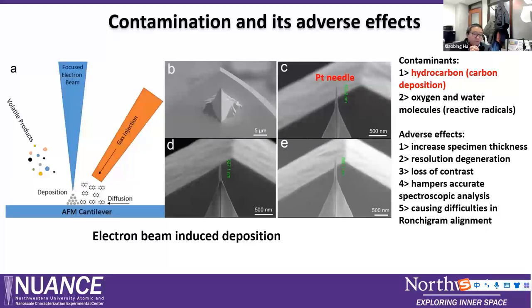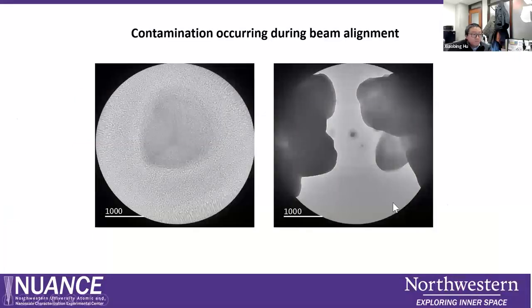The final one is that contamination will cause many problems when you do beam alignment, as I showed you before. So now let me show you more details.